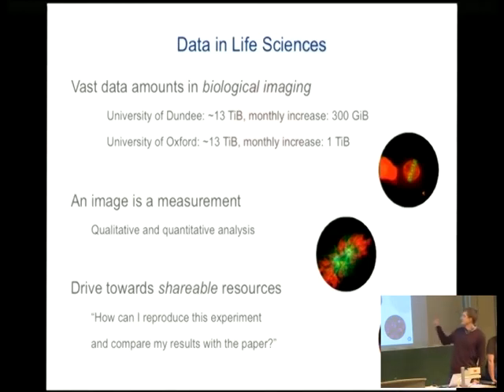An example you can see, those are pretty images, quite colorful. In 2 dimensions, they look quite appealing, but what can't be seen here is the spatial information, the temporal information, multi-channel information. In reality, those are multi-dimensional images, and each channel, each modality has to be captured in the raw data. Hence the size of captured data, and hence also the drive towards shareable resources.